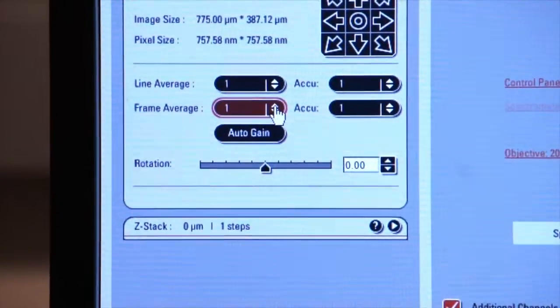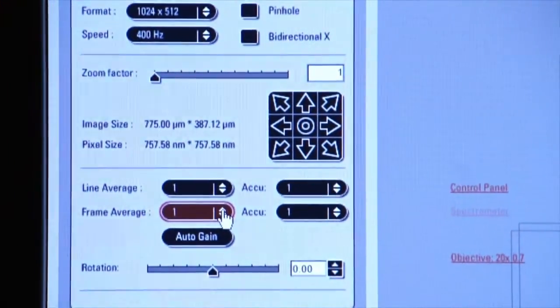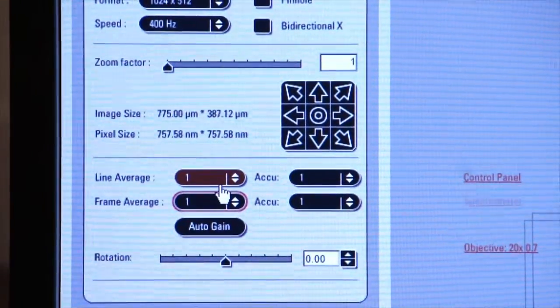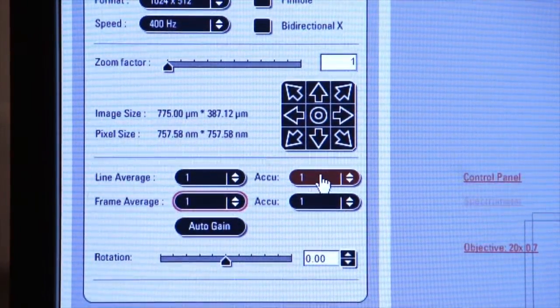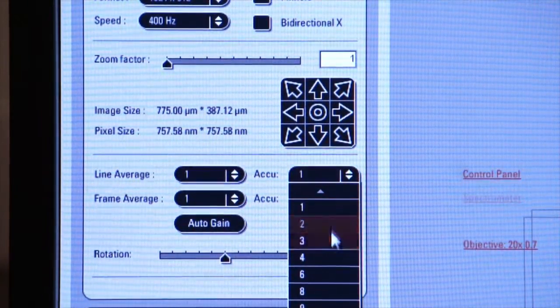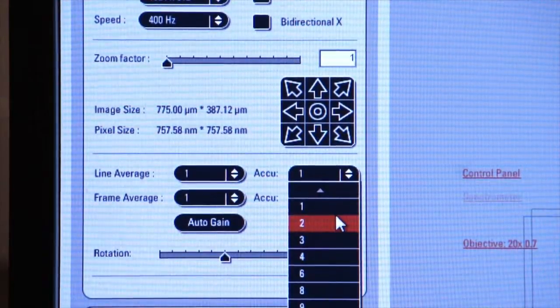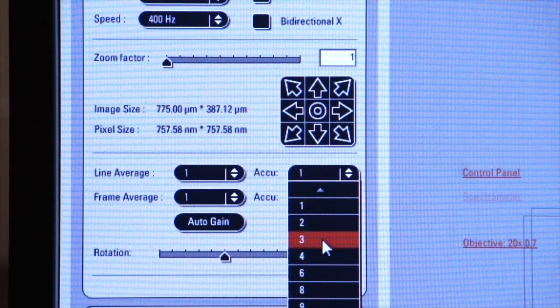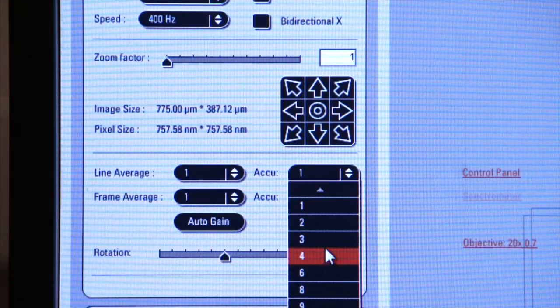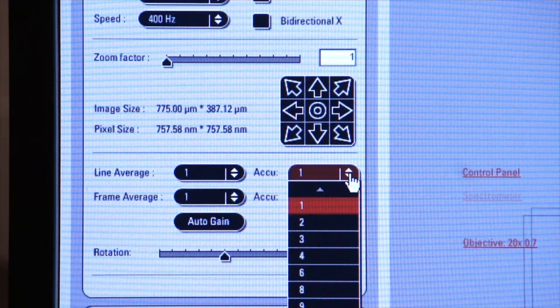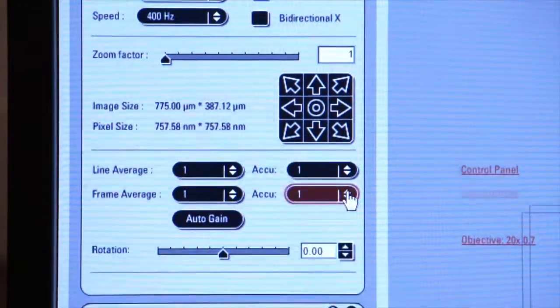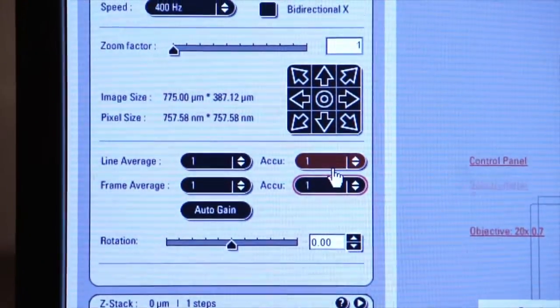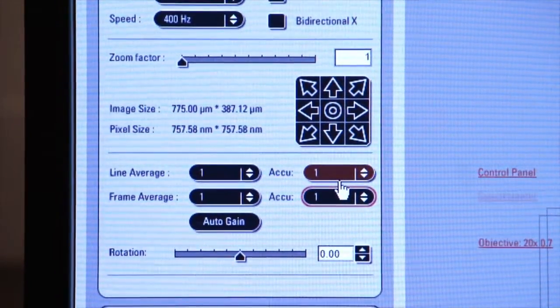There are also two other tabs here for accumulate. You can accumulate the number of lines. So if you have a very dim specimen, each line that you scan can become added to the next line depending on the number that you select here. The same goes for frame accumulation. Very rarely will you use these, but in some cases, you might have a very dim return on your fluorescence, so you might want to accumulate all that information.